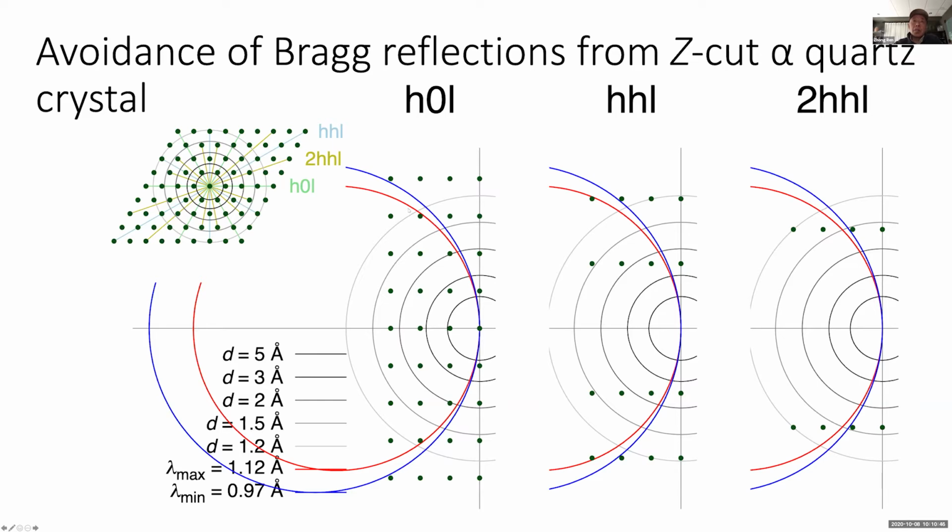So it will miss all of them. So no matter which way you look at it, if you miss all of them, then there will be no Bragg reflection occurring, which is to say none of these Bragg reflections will meet its diffraction condition. Of course, within the interest of protein diffraction resolution, beyond that, it's totally possible that we'll hit Bragg reflection, but who cares? We're not interested in that resolution range.